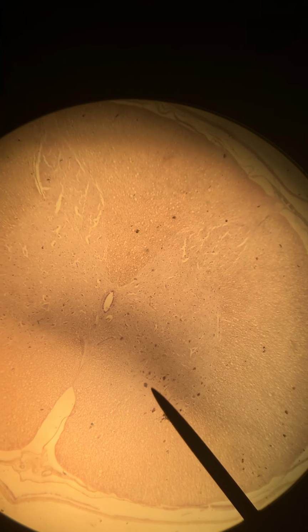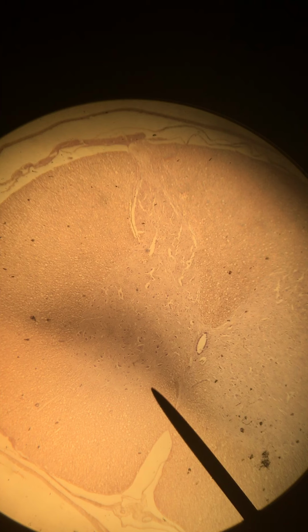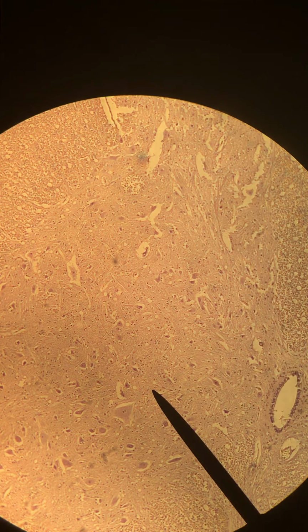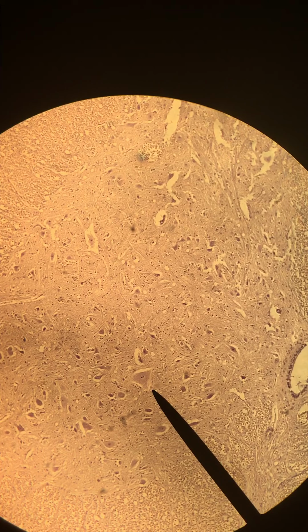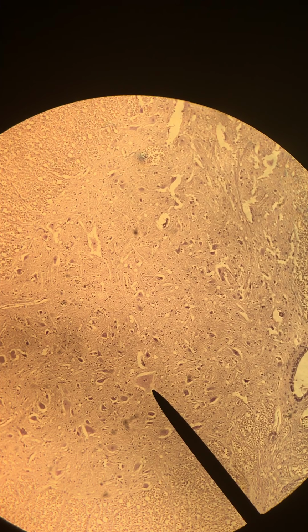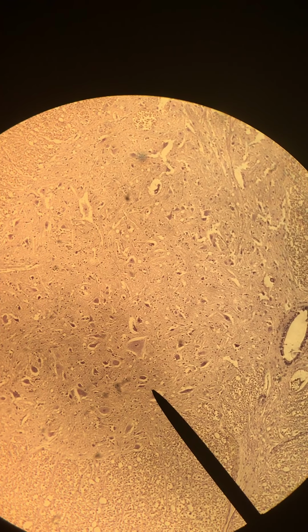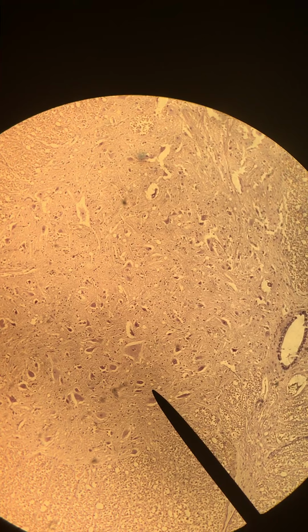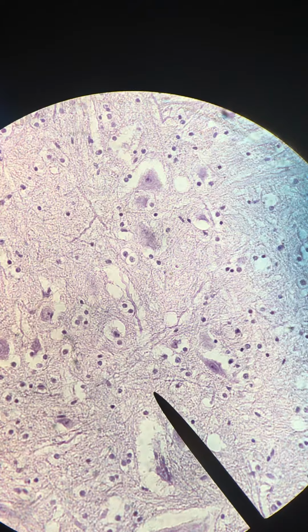Okay, so right now I'm going to zoom in on a portion of the gray matter to enable us to hopefully take a good look at a motor neuron cell body. Okay, so let's zoom in. I have us at 100 times total magnification right now, and you can start to see shaping up. There's a nice big neuron. Looks like there's another one here, and several others that we can take a look at. So let's zoom in one more time. And yep, sure enough, we've got a couple good examples.